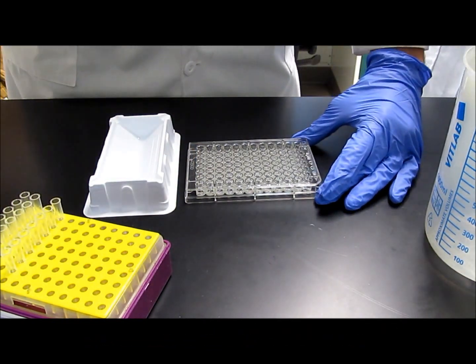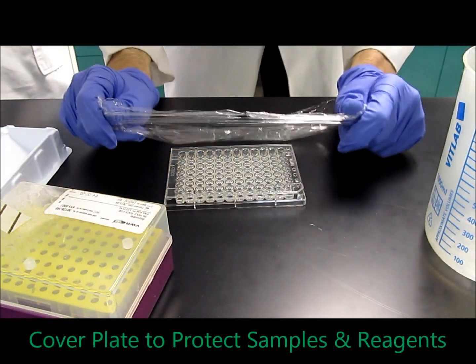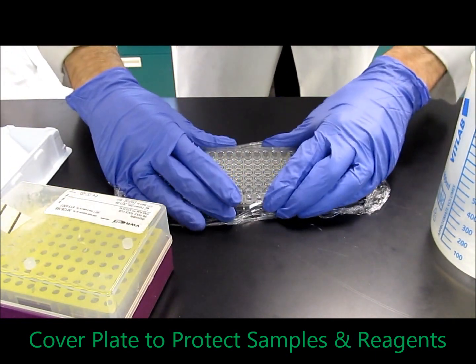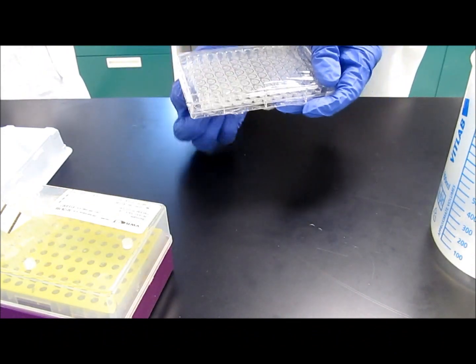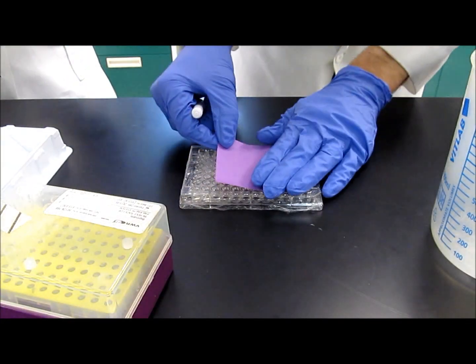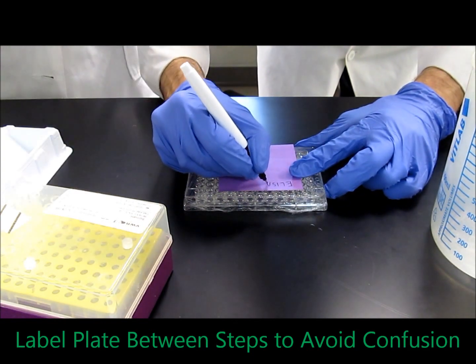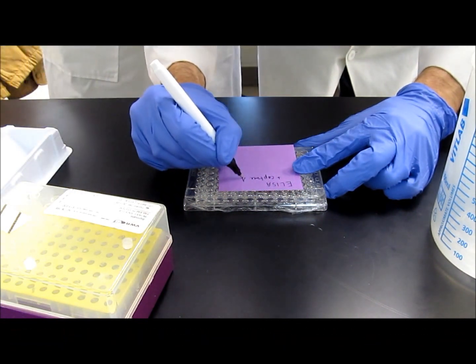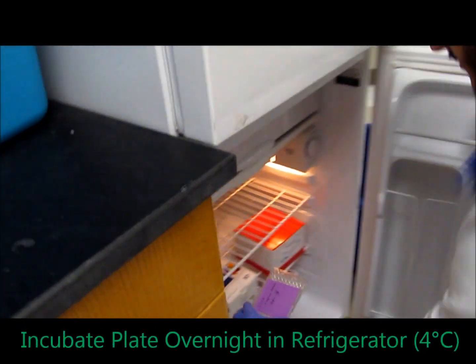After that, give the plate a gentle tap to remove any air pockets. Then wrap the plate in plastic wrap to prevent any reagents from evaporating overnight when you leave the plate in the refrigerator. Once it's wrapped thoroughly, grab a post-it note or a piece of tape to label the plate so you don't forget what step you're on, or to prevent other people from picking up your plate. You're going to leave your plate overnight in the refrigerator at 4 degrees Celsius.